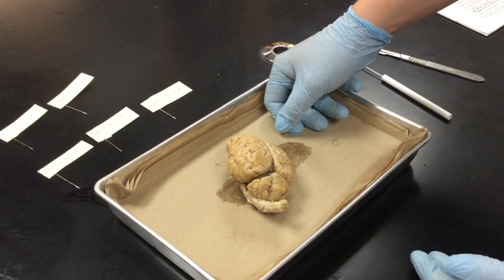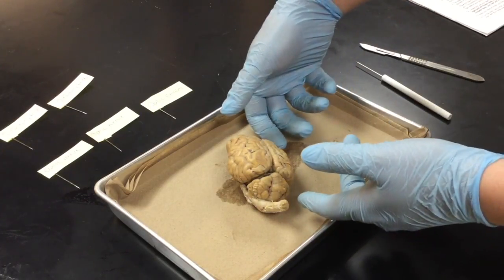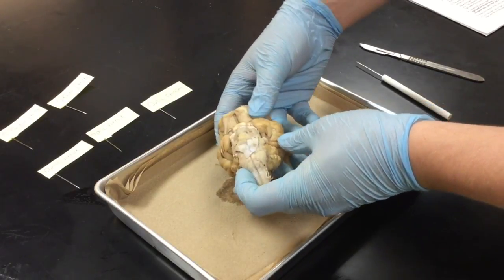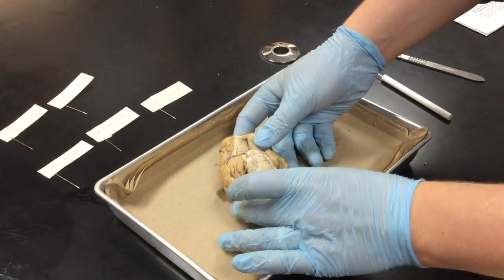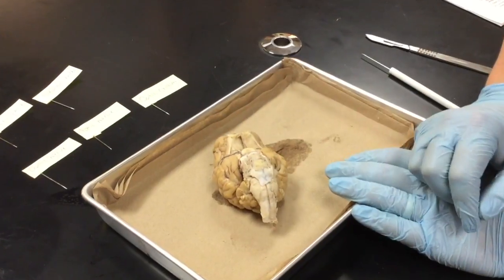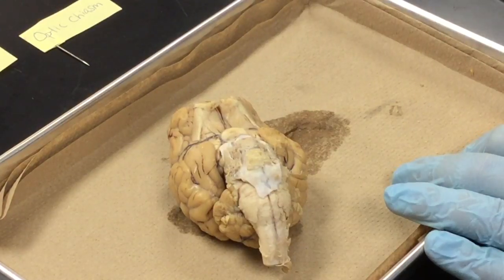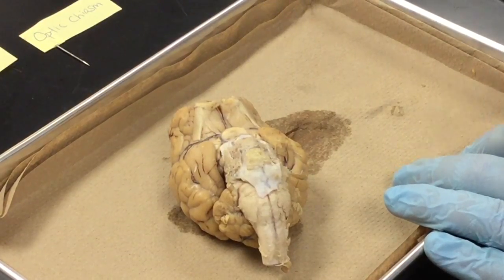To look at the next part of the brain we want to study, we want to take the brain and we want to turn it upside down. So therefore, with the frontal lobe still facing away from you, you're going to take the brain and set it like so. So on the bottom portion, we're able to see certain individual structures.